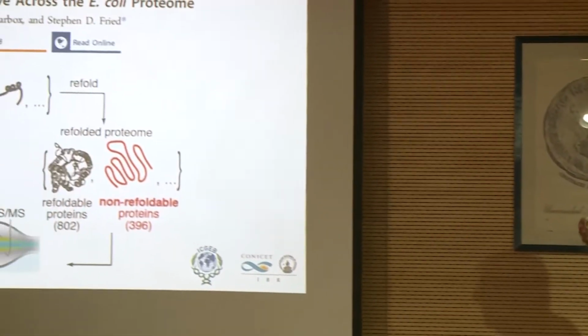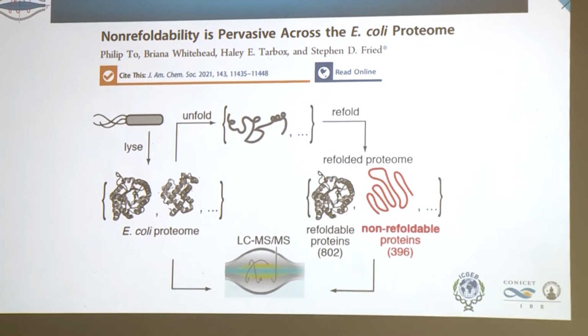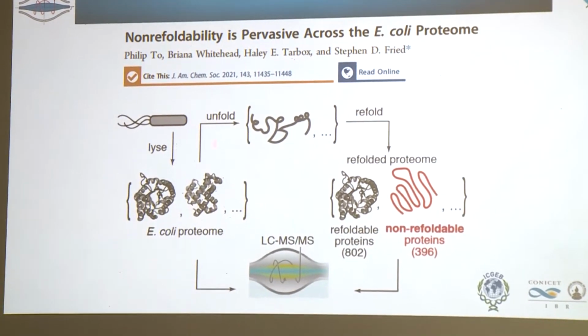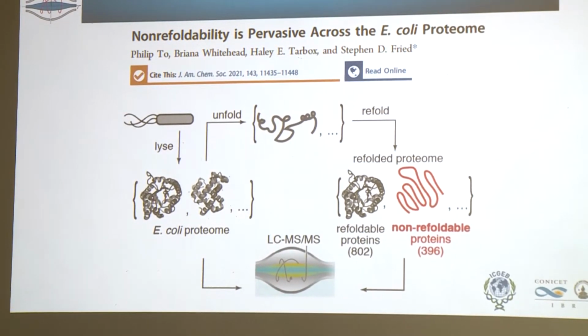So let's see, for example, this is a paper published this year where these guys decided to study the whole refoldability of the E. coli proteome.